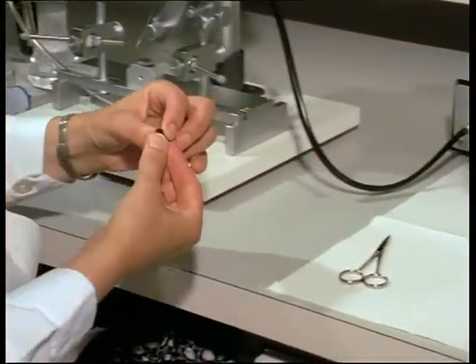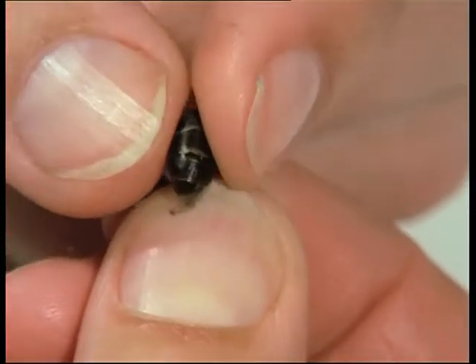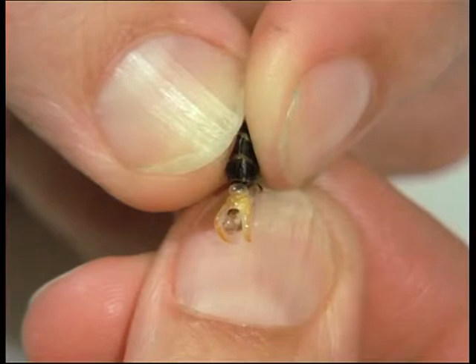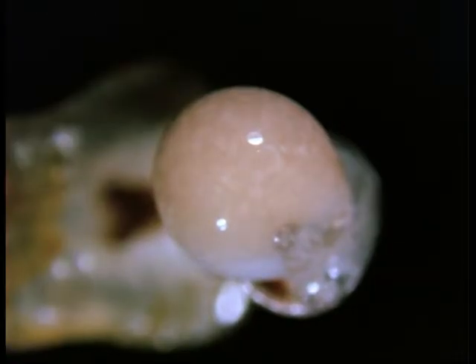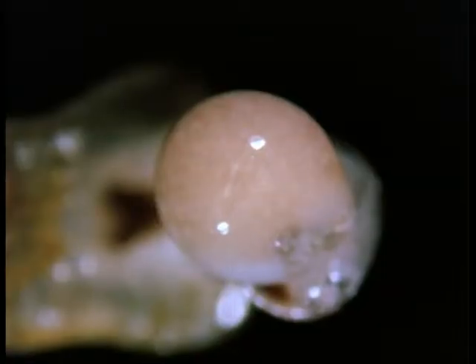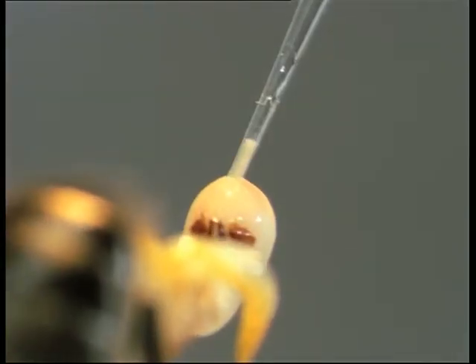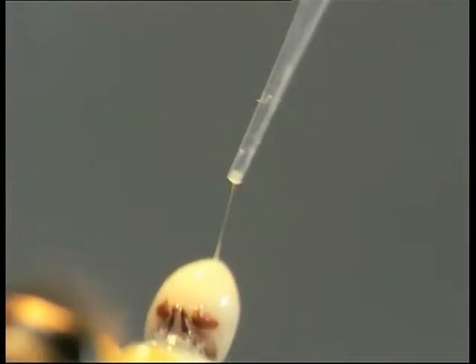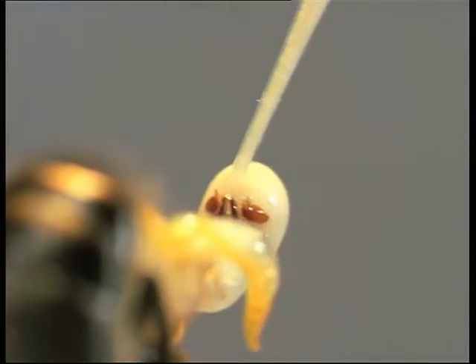Drones which have been reared in cages by workers are used as semen donors. Rolling and pressure on the thorax and abdomen effect the first phase of eversion of the copulative organ. Further pressure results in complete eversion and ejaculation. Mature sperm is cream-coloured and marbled in appearance. It often covers the white mucus plug of the endophallus. Using the glass tip of the insemination syringe, merely touch the surface of the semen. In aspirating the sperm, none of the mucus should be allowed to penetrate into the syringe, thus preventing the cannule from becoming obstructed by a mucus plug.